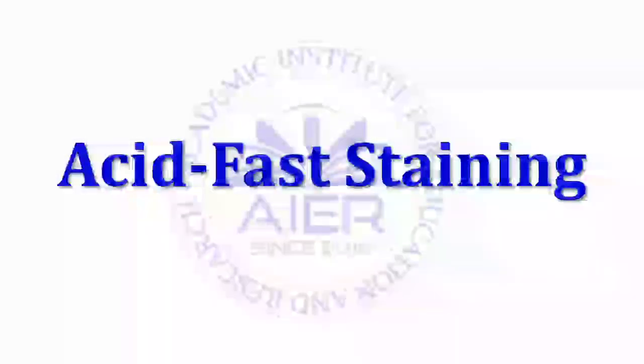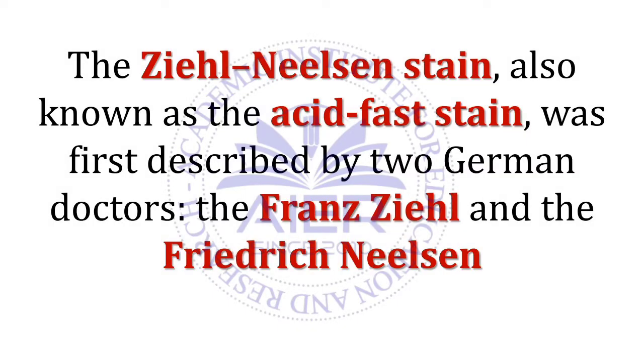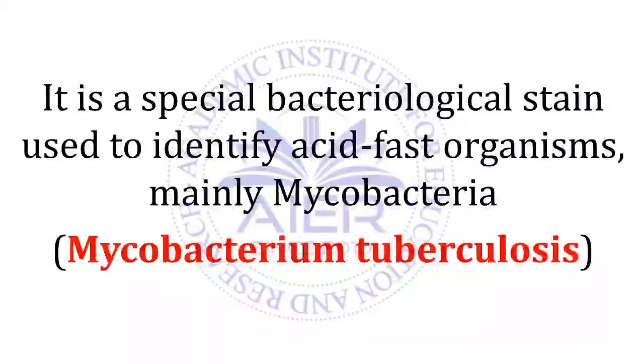Now if we move to acid fast staining, it is a kind of staining procedure applied for another type of microorganisms which are unresponsive to Gram staining, right? Basically, the Ziehl-Neelsen stain, also known as the acid-fast stain, was first described by two German doctors, Franz Ziehl and Friedrich Neelsen. It is a special bacteriological stain used to identify acid-fast organisms, mainly the Mycobacteria, or we can say Mycobacterium tuberculosis, which is responsible for the development of TB.